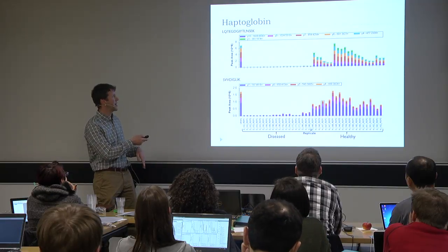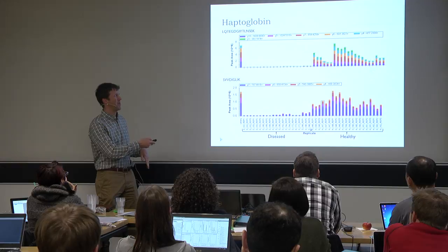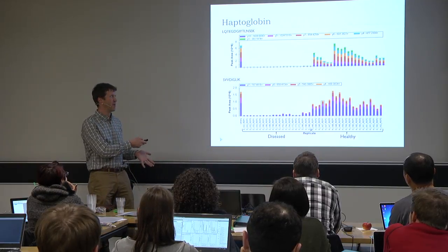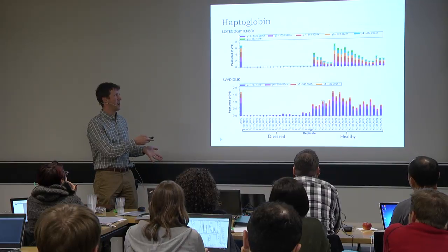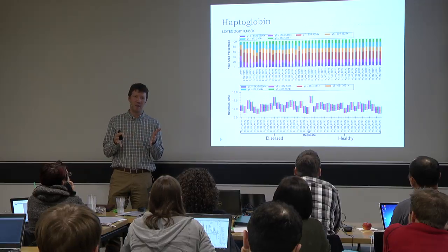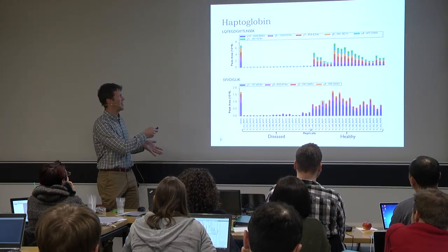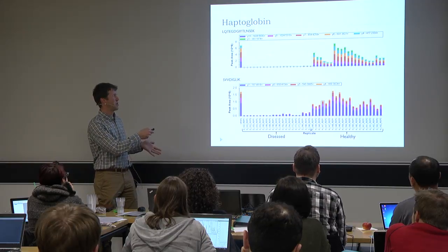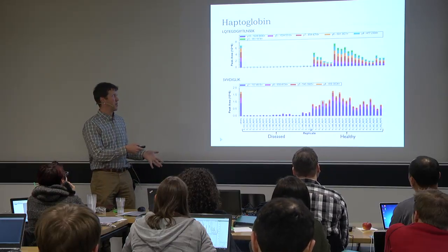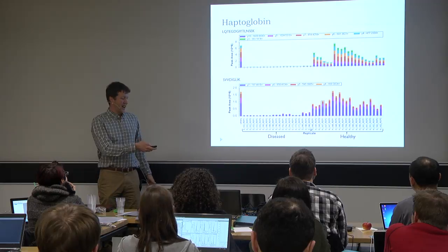So that's what it looks like. And you can see that there's a fair amount of variance in the absolute peak areas, they are not exactly the same over on this side. So it's kind of amazing that the relative abundance is that consistent when the absolute abundance is changing that much. But when you really get down to what is probably at least a 20-fold change, then you get down to low abundance and you get all that variance.